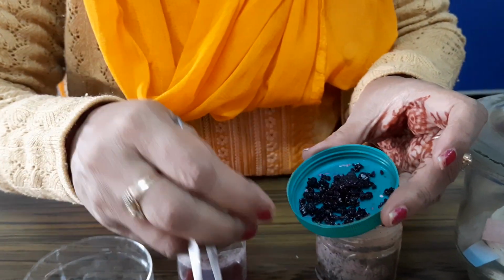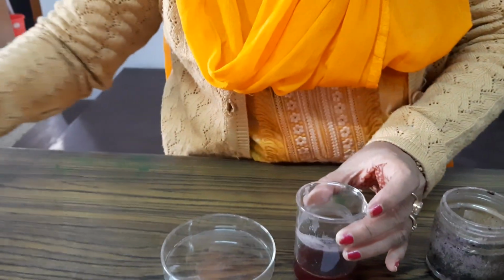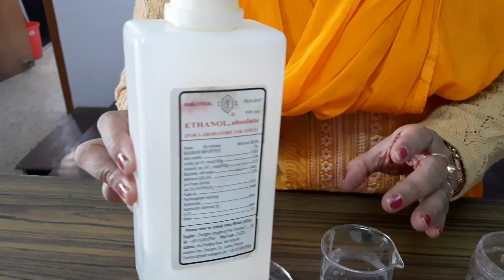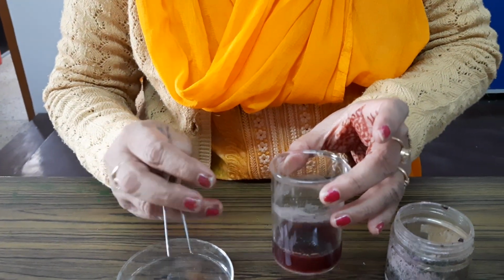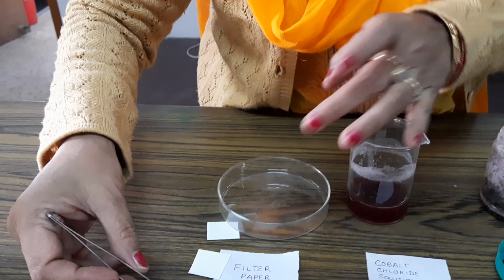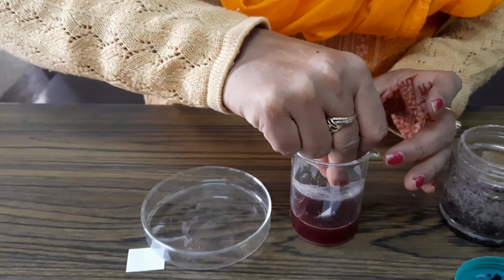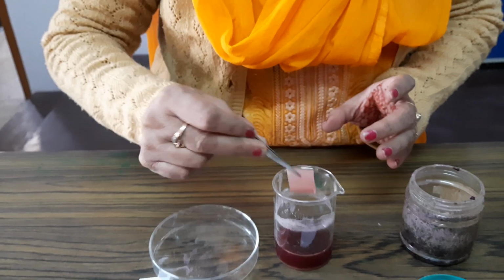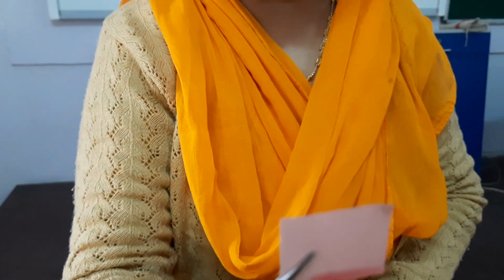I will take a few pieces of this and dissolve them in ethanol, that is alcohol, which I have taken here. In alcohol I will dissolve a few crystals of this. You can see it is completely pink in color. Now I will take one piece of filter paper and dip it in the cobalt chloride solution. You can see that it has turned pink, right? So the color of the wet cobalt chloride paper is pink.